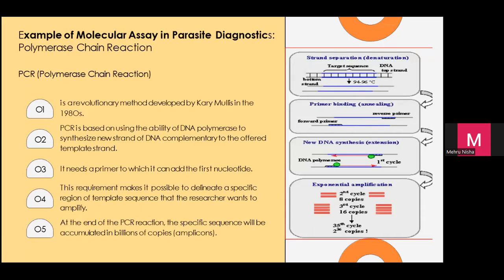Faham. So the primer usually ATCG ni kita beli dari industri. Kalau kita ada molecular company sini, kita just call them, kita order. Sebab yang ni usually, I'm not sure about Yogyakarta, tapi di sini pun kita tak ada sequencer ni. Sequencer ni mesin yang besar, dan kena kepakaran untuk buat ATCG semua. Jadi kita just order, tapi mesin PCR kita ada. So like that.